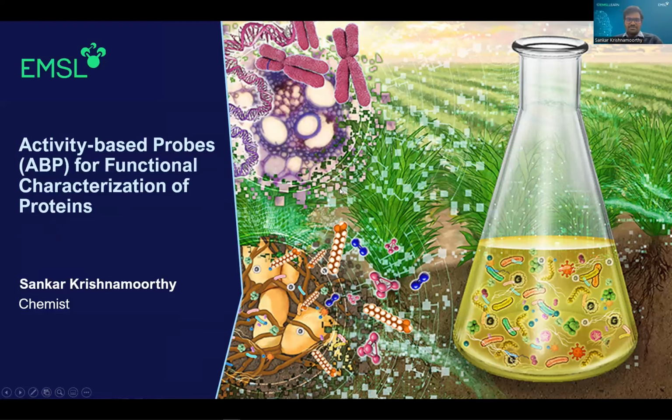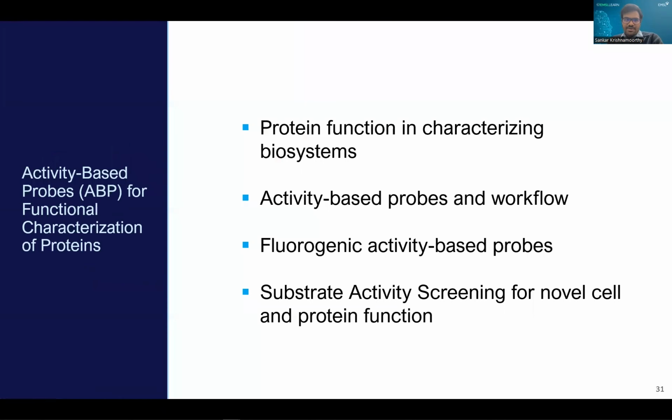Hello, everyone. I'm Sankar Krishnamoorthy. I'm a chemist here at EMSL. Today, I'm going to be talking about activity-based probes, how you can use them to functionally profile some of the biological system you're working with. I'll introduce you to 2 types of activity-based probes, and then I'll touch upon substrate activity screening approach for novel protein function and cell function characterization.